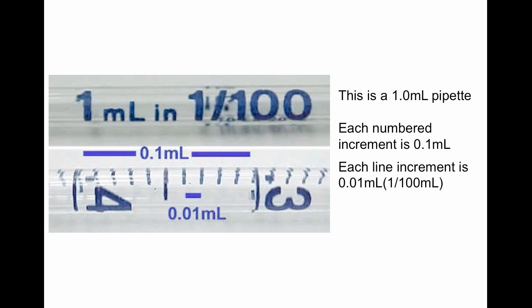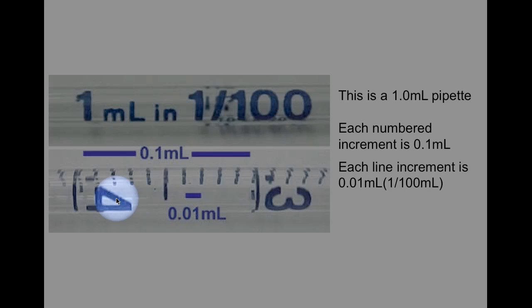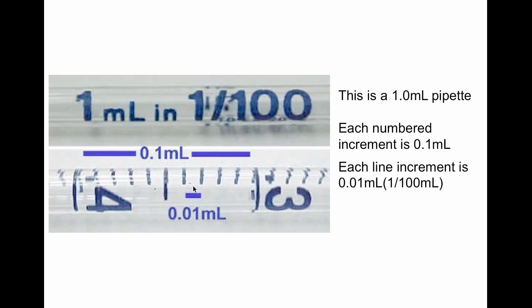One other example, this is a 1 ml pipet. Each numbered increment is a tenth of a milliliter. So between the 4 and the 3 here, this is 1 tenth of a milliliter and each little line now represents 1 hundredth of a milliliter. So as I said, you need to pay attention and read what's printed on the pipet so that you know exactly what you're getting.